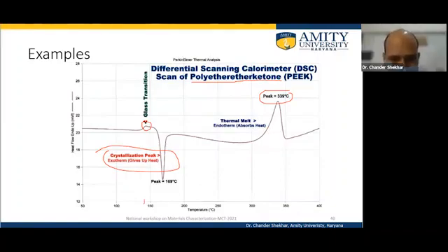Oh, sure, we can measure the heat capacity. If it is not inert, then the heat of transformation, or the latent heat of that particular transformation, can be determined along with the heat capacity. Because the inert samples do have heat capacity that can be determined.